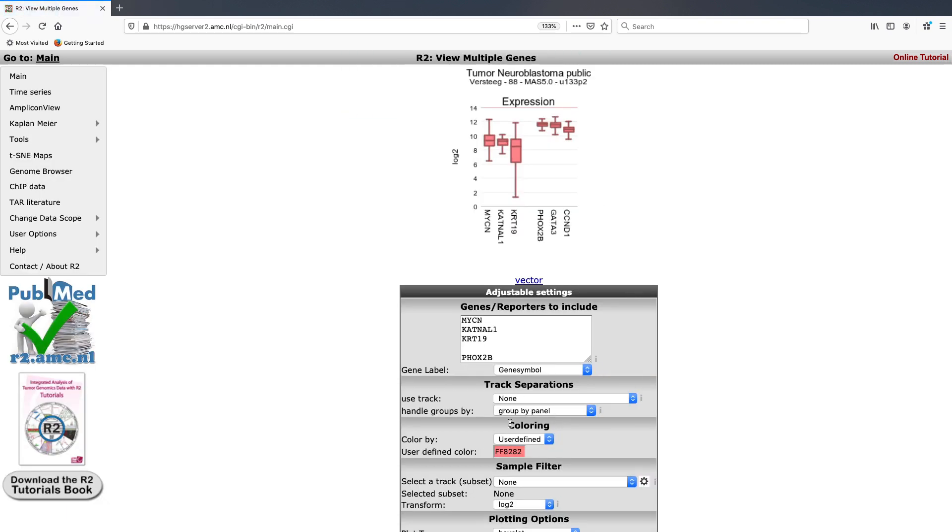Here we are presented with a basic box plot of the panel of genes that we wish to look at. They are currently displayed as log two expression values.